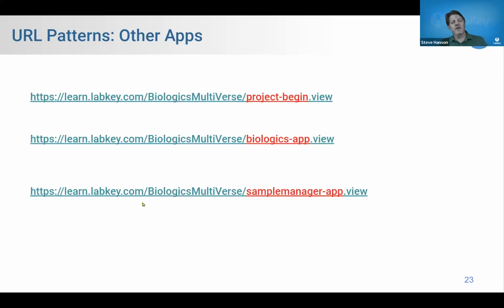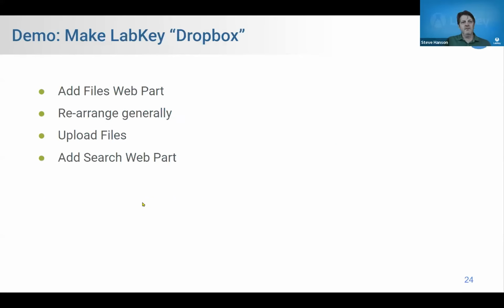I'm running out of time, so I'm going to kind of bop ahead here a little bit. Let's actually build something. I said I was going to build Dropbox. Let's do it.